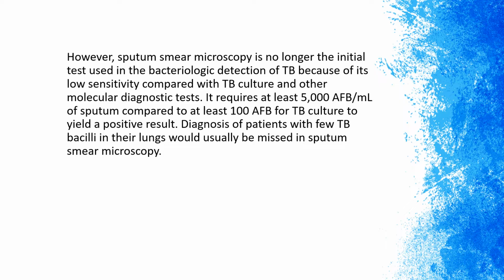In addition, bacteria like Nocardia, Legionella, and cysts of Cryptosporidium and Isospora can be stained by these methods as other acid-fast organisms.